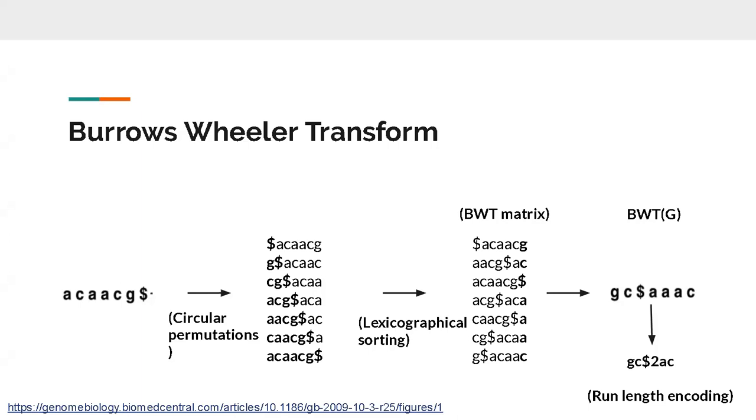You can download the already indexed files from the internet. The reason we are taking this much pain is because the searching becomes much more effective as opposed to the other data structures that we have. Yeah, sure, got it.